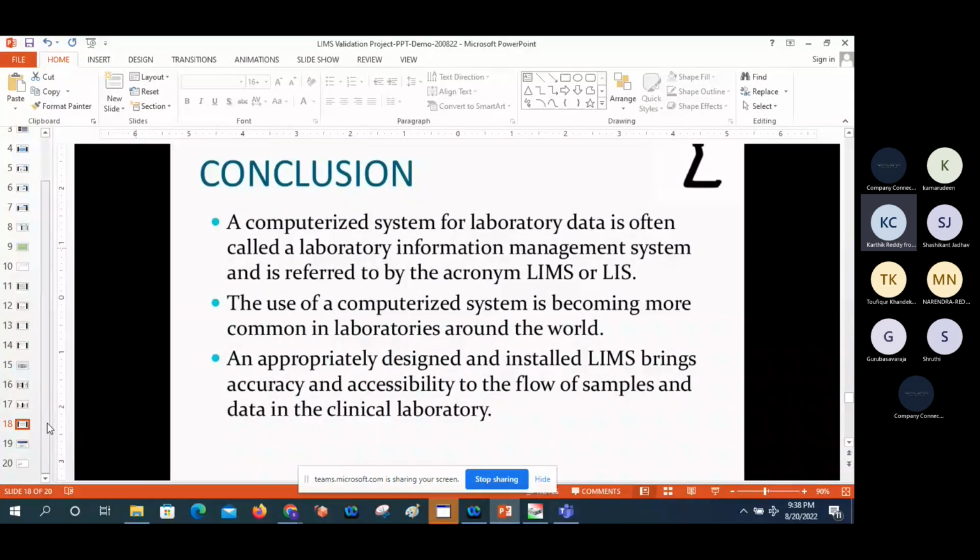Template design is different. That is generally not given by the vendor. We can't create it, right? Yeah. See, for example, a sample login template is there in LIMS. Okay. Sample login template we can't create directly. Yeah, we can create, sir. But based on the business person's requirement, we can modify things, right? Yes, all that we can modify, but there is SQL coding inside. Got it. Yeah. So if you touch that, it will hamper something somewhere.